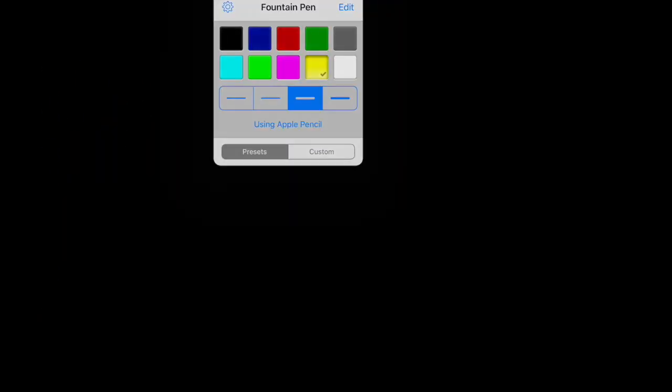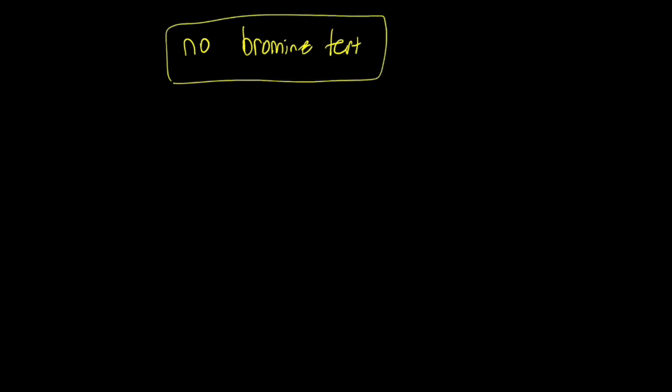Now, as we saw in the previous lab, we had situations with the bromine, so we're doing no bromine test today, okay? I'm going to look into the best way to do this in the lab without actually buying bromine off of eBay, so for now, don't worry about this semester, okay? It's something I have to worry about. All right, so look at the limonene lab to review the Bayer test if you need to, okay?